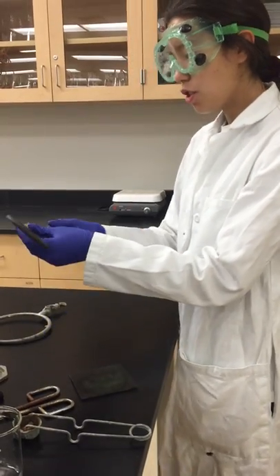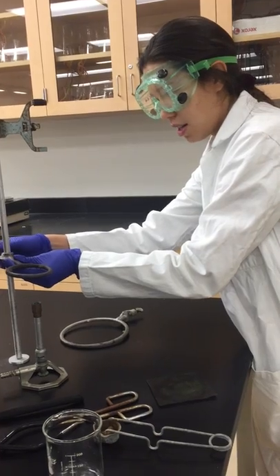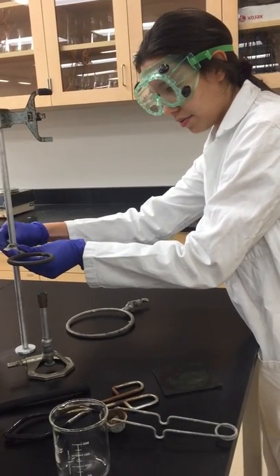So first we're going to place the first metal ring about 3 centimeters above the Bunsen burner and secure it to the ring stand.